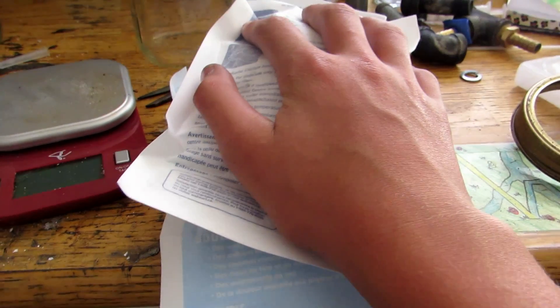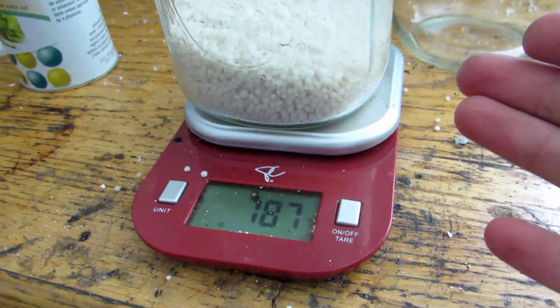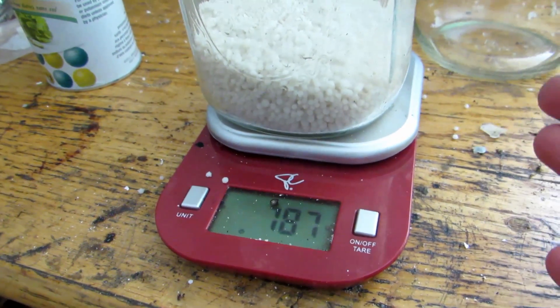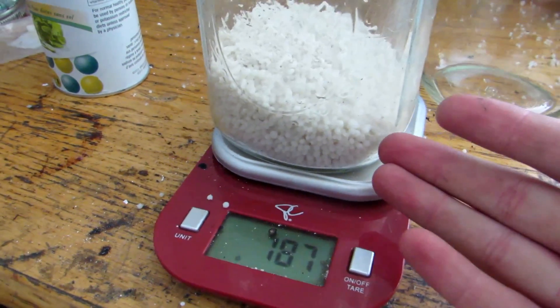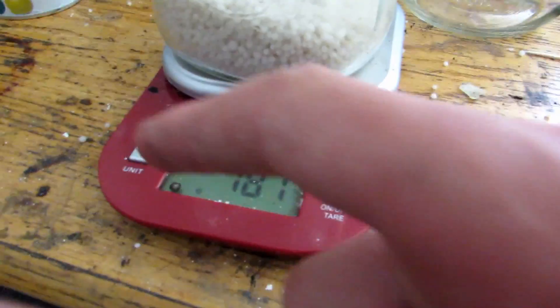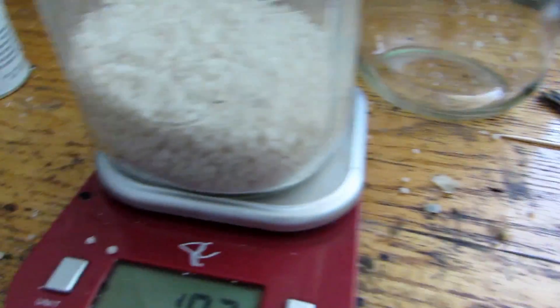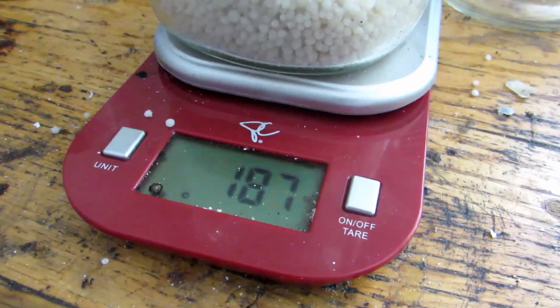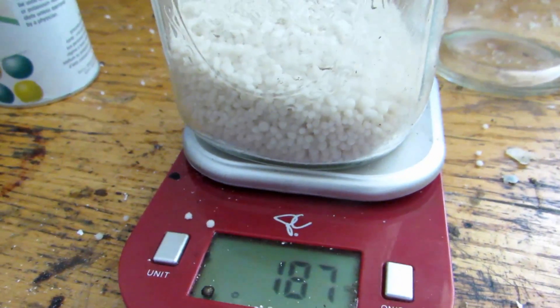I'm going to be trying to make potassium nitrate from calcium ammonium nitrate today. We'll open both cold packs and pour everything into this jar. If you're looking for these, I got them from Walmart — we also used them in a separate video to make nitric acid, so they have multiple uses. We ended up with 187 grams, and since I spilled a bit it's probably about 190 grams total across those two cold packs, roughly 85 grams each. We'll see how much potassium nitrate we get.